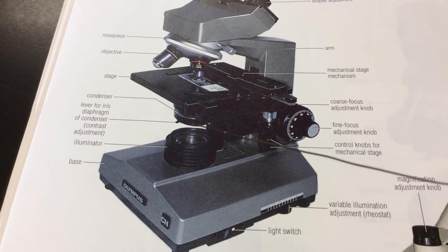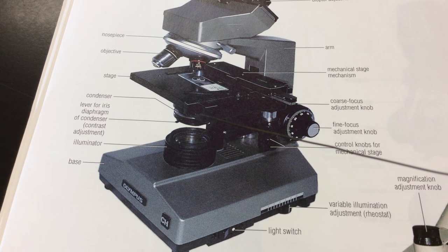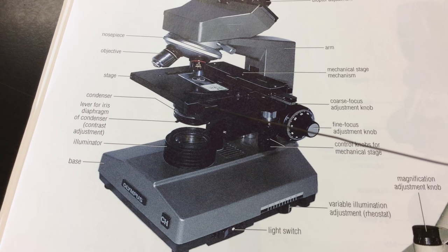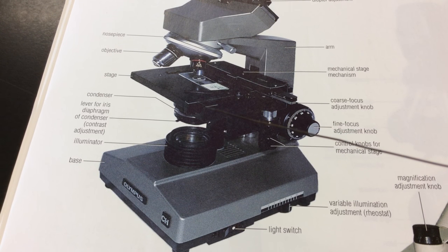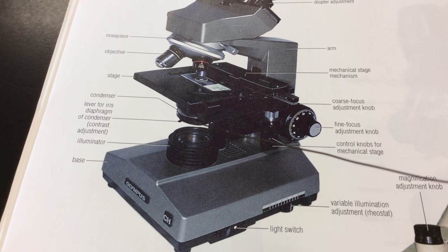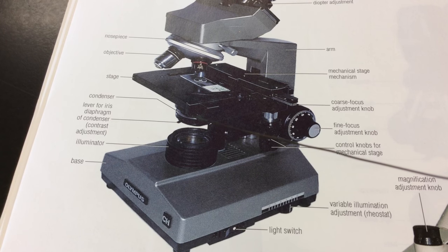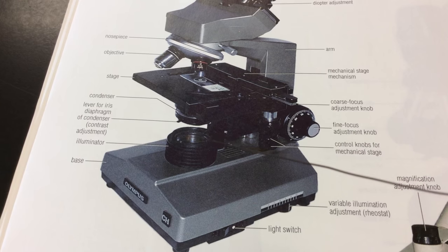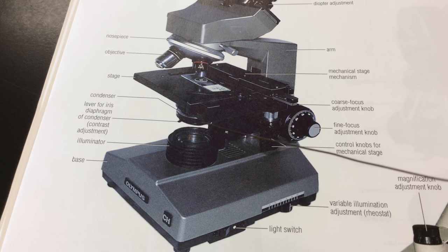In contrast, if we're looking at maybe living microbes that haven't been stained, they're going to have very low contrast with their surrounding. We're actually going to reduce the amount of light striking our specimen to increase contrast. So one way we could do that is to close down the iris diaphragm to decrease the amount of light striking the object. Another way to increase contrast is to lower the substage condenser, to decrease the amount of light that's going to strike our specimen.